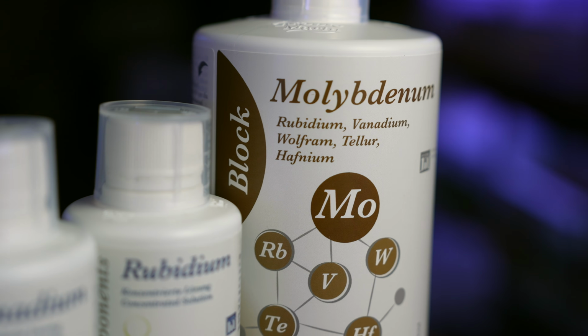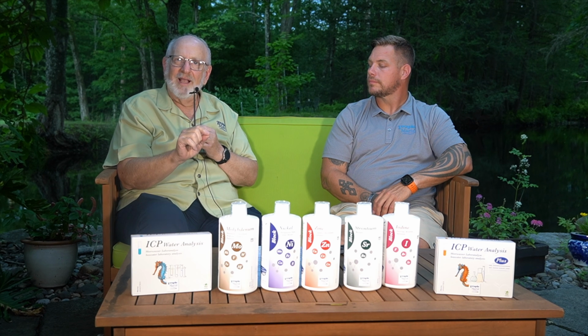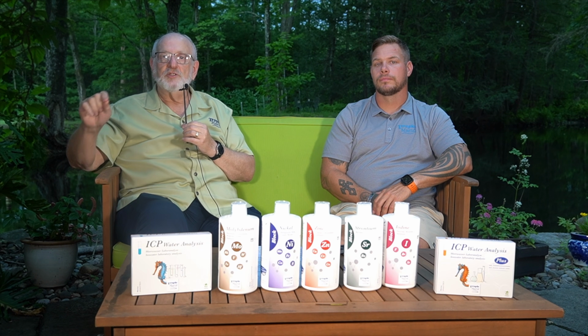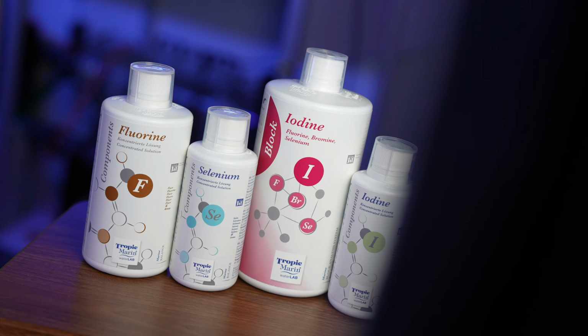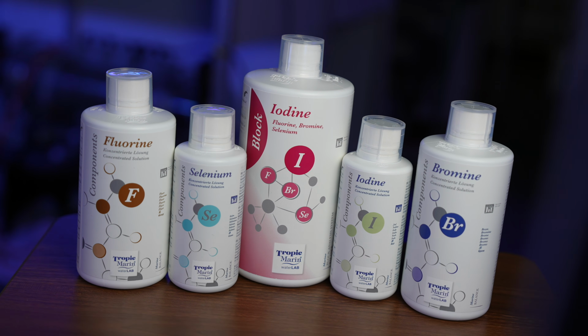And so if you can accurately and very precisely measure that one indicator element, that gives you a lot of insight into what the other concentrations need to be and what kind of corrections need to be made in those other elements in that same family. Lou went in depth with that, and we want to give an example.